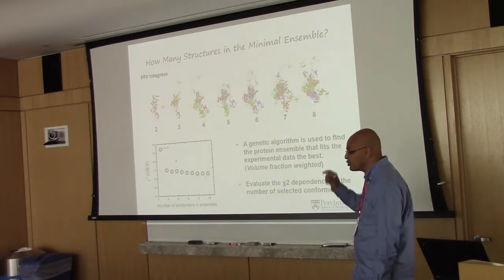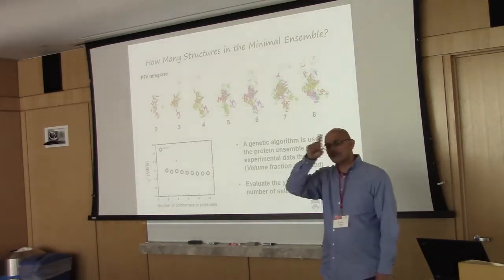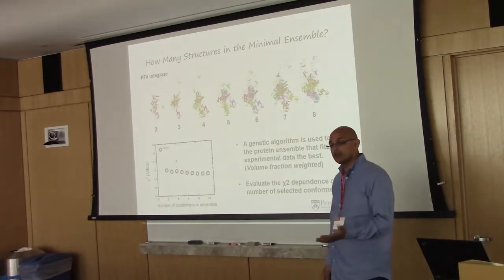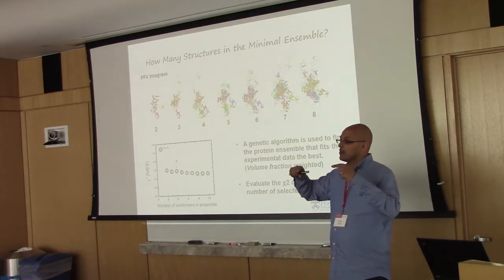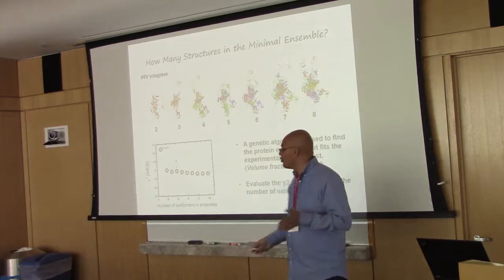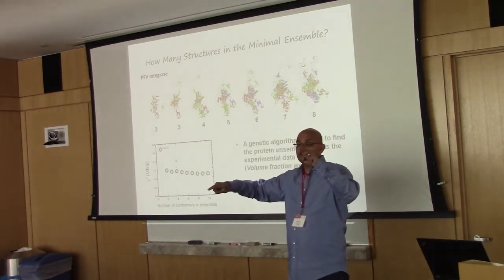But I think what we're finding visually with the profile, chi-square is not great in Spark, but this will give you a visual criterion as well across the entire scattering profile. We found that 4 was the most appealing in terms of visual concordance with the experimental data across the entire scattering angle. So it's important not just to look at chi-square, but also look at your actual data to see where it deviates.